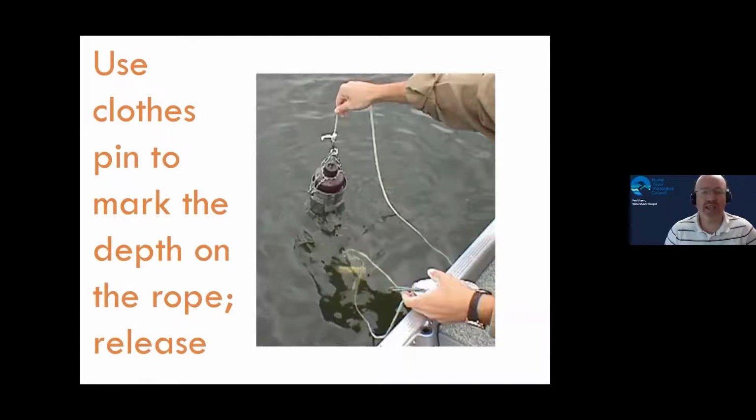What you do with the clothespin is mark your line at the point that is the depth you're going to drop this thing to. That way you can know exactly how far down it is at any moment, because you can keep your eye on that clothespin. If your integrated sample depth is 30 feet, mark your clothespin at the 30 feet mark on your line, throw all the line overboard, and then you can just release this thing and it will drop. It has these weights in it, so it will drop fast. And you want to stop it when it gets to the clothespin, the depth at which you want it. So you just let it free fall.